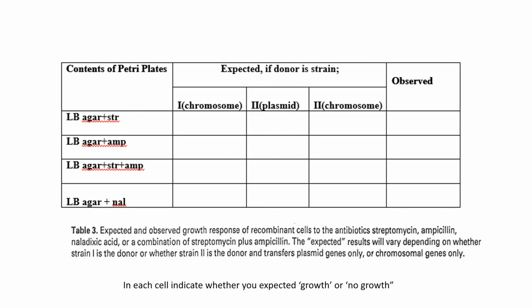The expected results will vary depending on whether strain 1 is the donor or whether strain 2 is the donor and transfers plasmid genes only or chromosomal genes only.